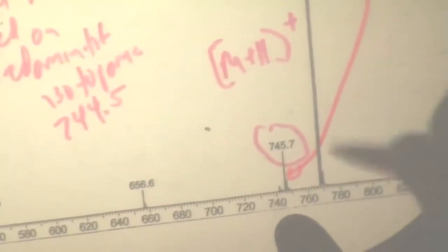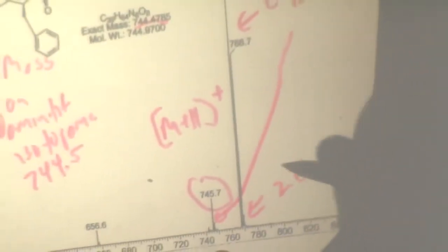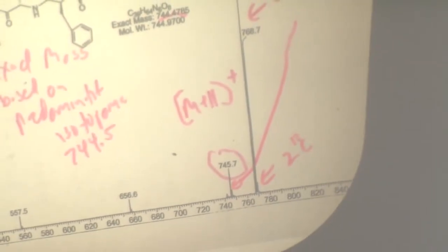This peak over here corresponds to M plus Na plus. Sometimes you will hear the biggest peak in the spectrum referred to as the base peak in the spectrum. This peak here corresponds to a C13 isotopomer. We'll talk more about that later. That's a molecule with one C13 in here. You'll see the same over here. And you'll notice you even see molecules with two C13s.